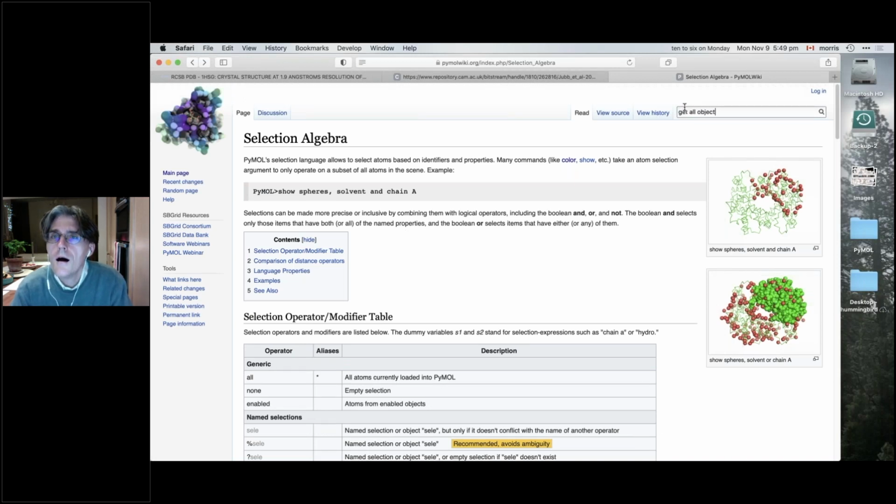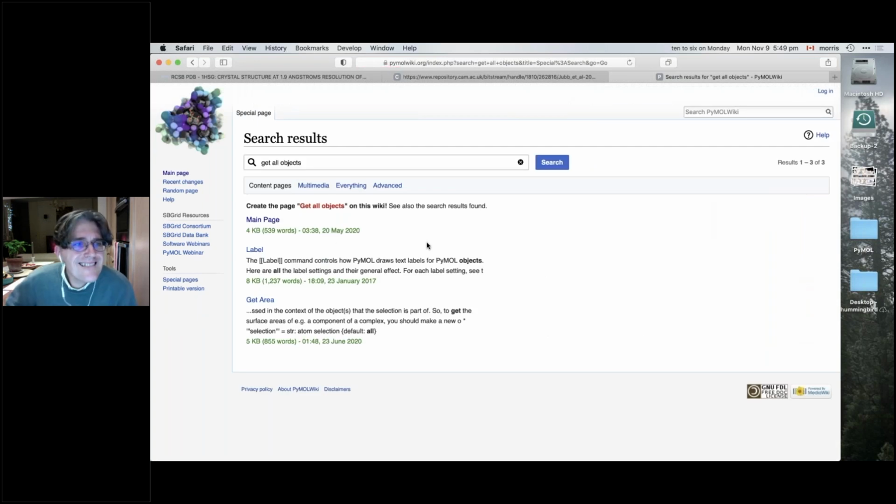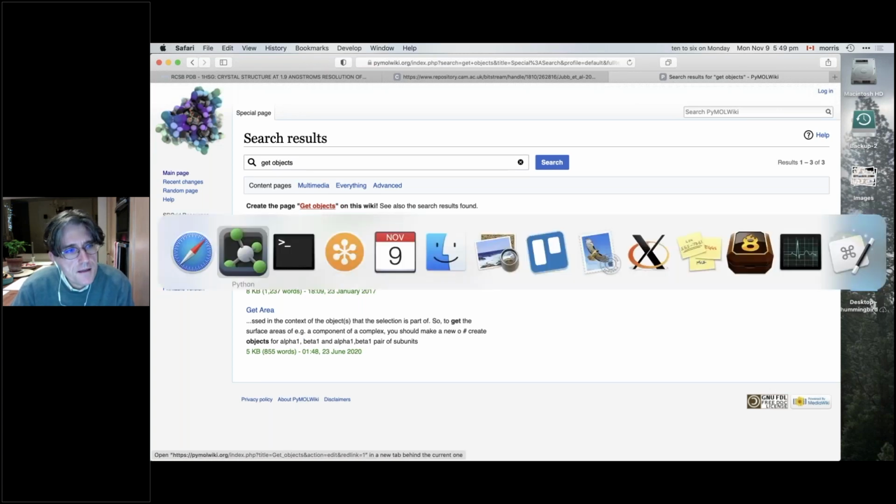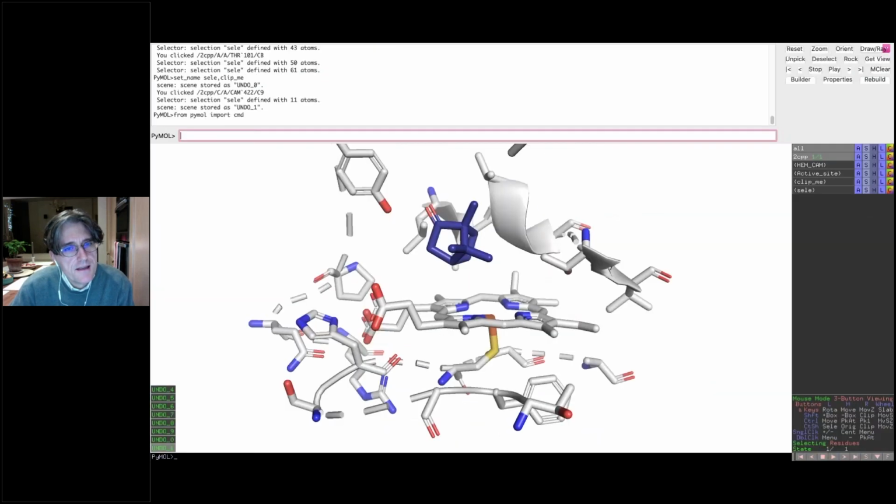This sort of brings in one of the other questions we've just got, which is, you're talking about the PyMOL programming language, but PyMOL's written in Python, isn't it? So could you comment on the interaction with Python? So, it's written in C originally, and it embeds a Python interpreter.